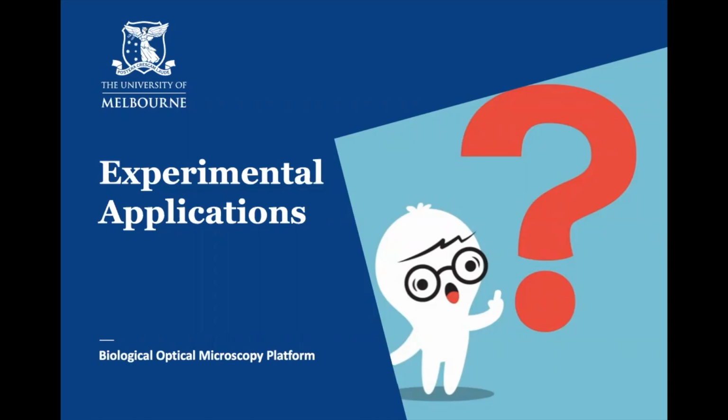So in this section, I'm going to pretty much focus on the systems that we have available within our platform. We by no means have every single system that's available. That would become very, very expensive. But I think it's a good starting point, at least, to make you aware of some of the applications that you can do using fluorescence microscopy.